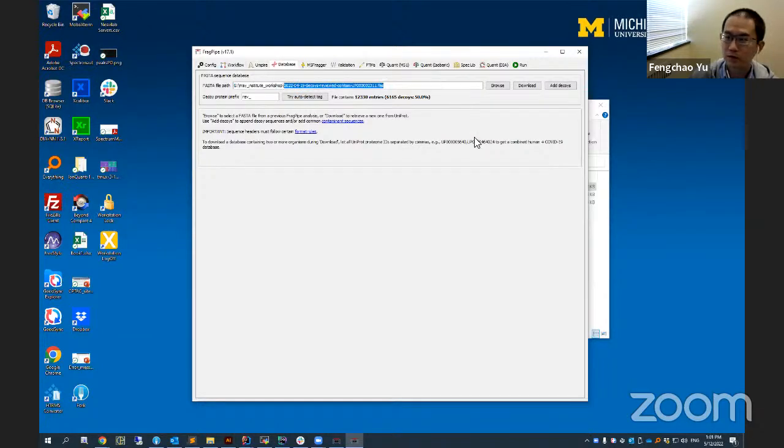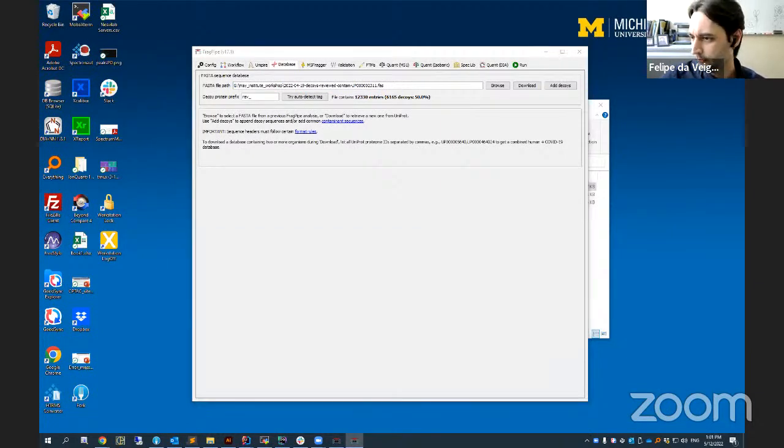It has. Fengchao, sorry. We have a few questions here in chat. Some people seem to be having issues with EasyPQP.